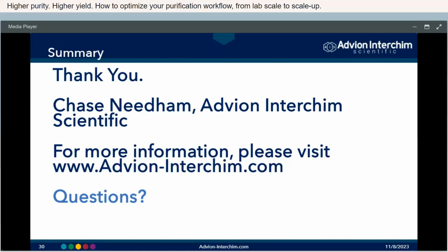Great. All right, it looks like we have time for one more question here, so we'll wrap up after this one. This question asks, can I use the Plate Express with C18 TLC plate? Yes, so you can use the Plate Express with just about any media that's available on a TLC plate. C18 is very common. You can also use it with alumina or an amino bonded phase, really any TLC plate you have. There's only a few considerations you need for the TLC plate.